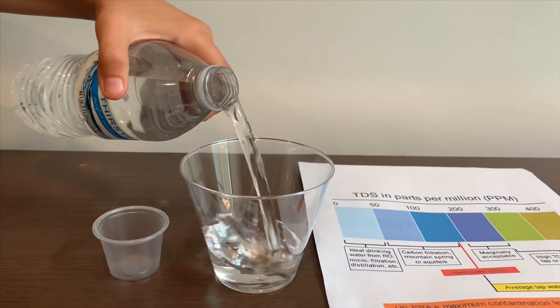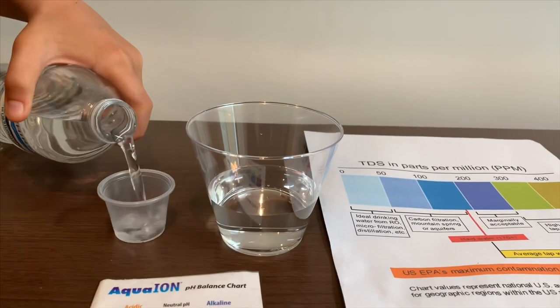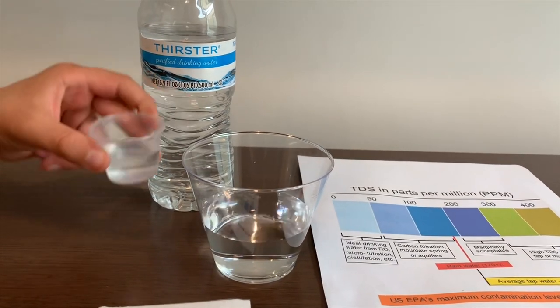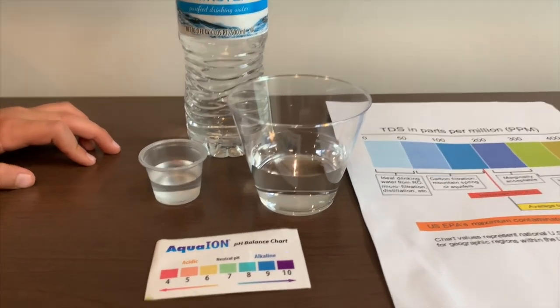Let's pour some water in. This is a little too much for the pH cup, so let's put it back in the TDS. First, we're going to test the TDS level.